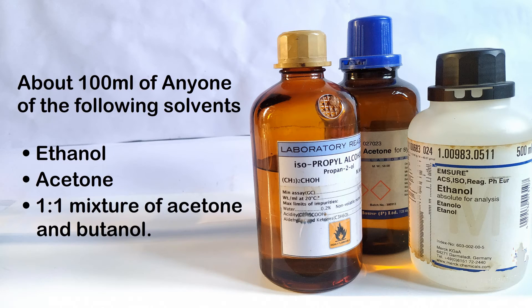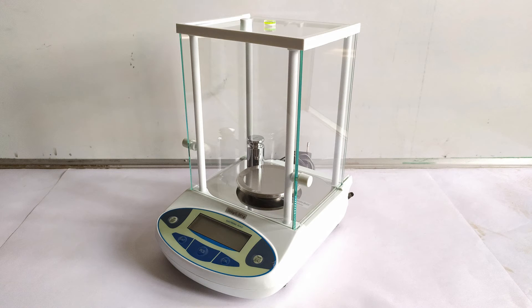Isopropanol can also be used as a solvent, but ninhydrin is not very soluble in isopropanol. You will also need an analytical weighing scale.